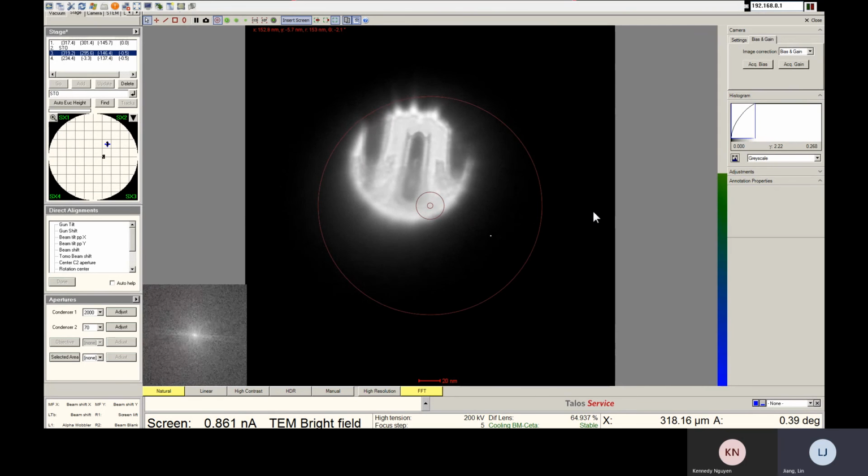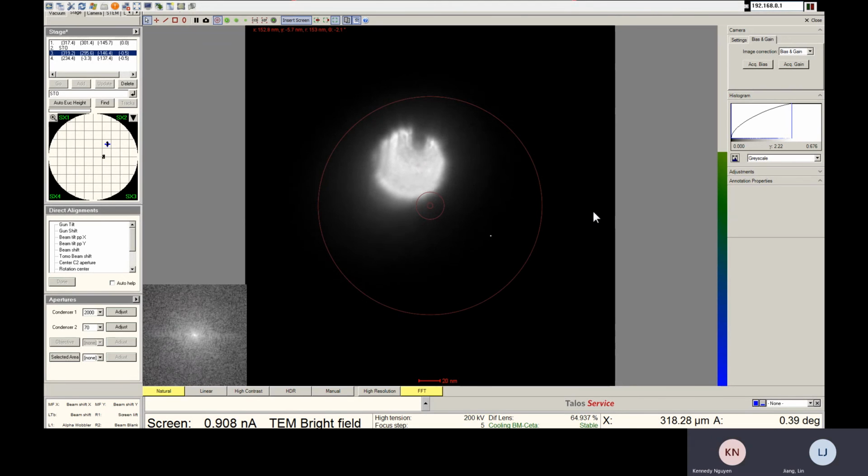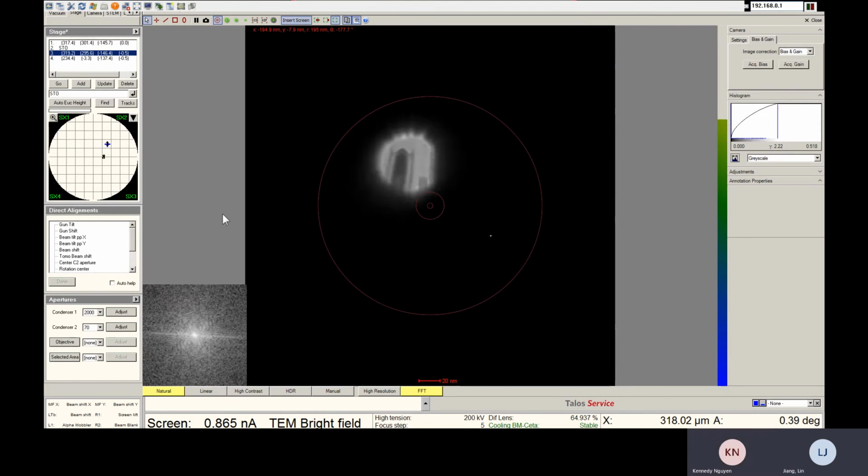If you want to still condense a little bit more, then probably we need, let me think a little bit. Because if we go for this intensity, we cannot adjust the intensity anymore, right? Yeah, it'd be too much. Let me think if there's another way we can reduce the intensity.